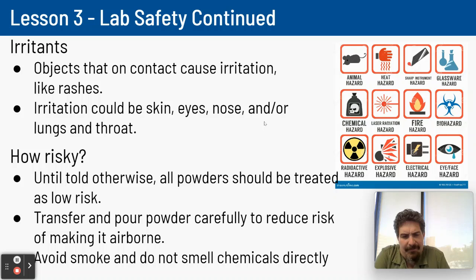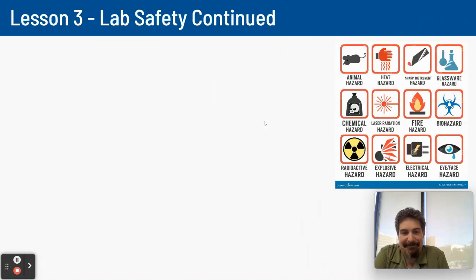So whenever we're transferring or pouring powder, be very careful to not toss it around by accident or trip and throw it or something. And if there's any smoke in the room, we shouldn't have much in the way of smoke, but if there is any, try not to breathe it in. And don't smell chemicals directly, because it could be something that really makes you feel bad when you do that.